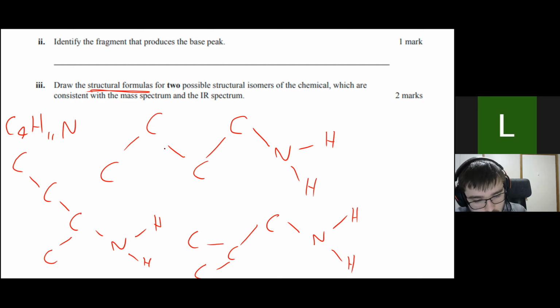If we break a single bond here for the ethyl, we'll get 29, which is close, but not quite there. And basically any of the ones we break here, so we can break off a methyl, will be 15. You can't add 2 methyls together to get 30 or something like that. If we knocked off a whole propyl group here, then that would be 43, so definitely not 30. So we're going to have to go at the other end.